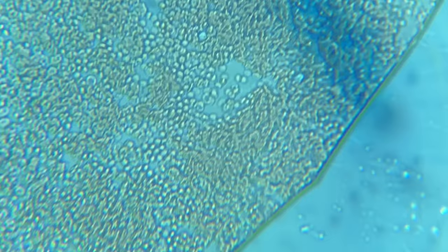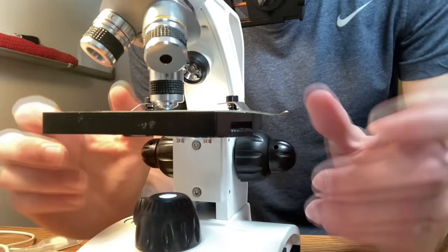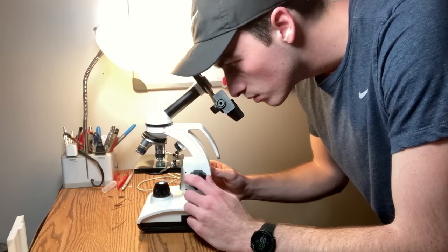Now, this could still be due to this being a slightly older sample, and maybe the hemoglobin, which is the protein that makes them red, may have denatured, but even the remaining healthy blood cells still have their main shape, and hemoglobin also helps them to retain their shape. So something else is going on here.